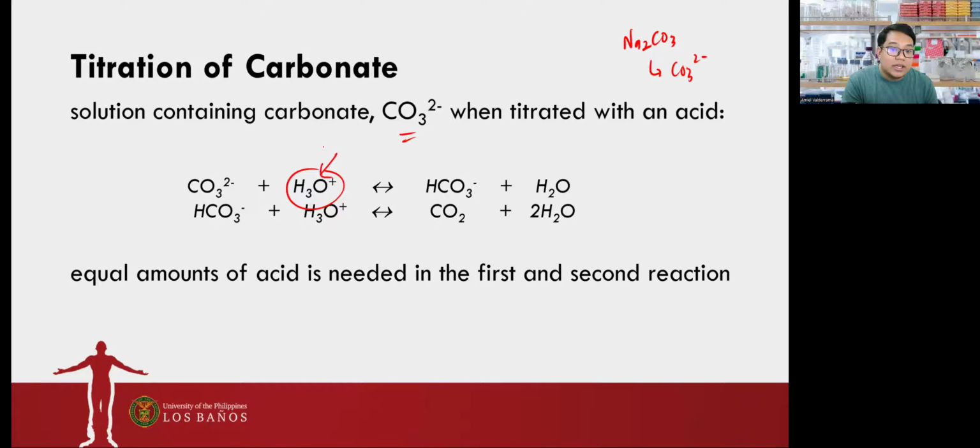That acid is your titrant. Ito yung ating standard HCl, as you can recall. Then the carbonate will form your bicarbonate ion. Then your bicarbonate ion, upon titration, will form your carbon dioxide and water. Na sometimes can also be in the form of carbonic acid. Okay?